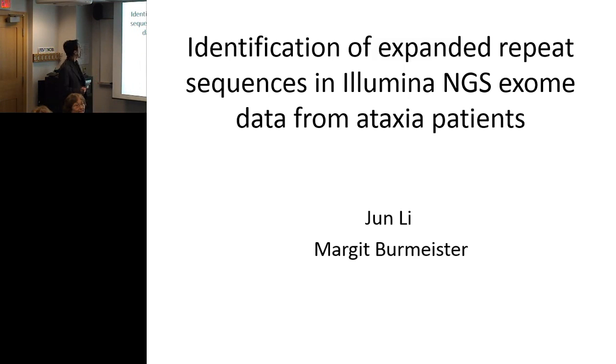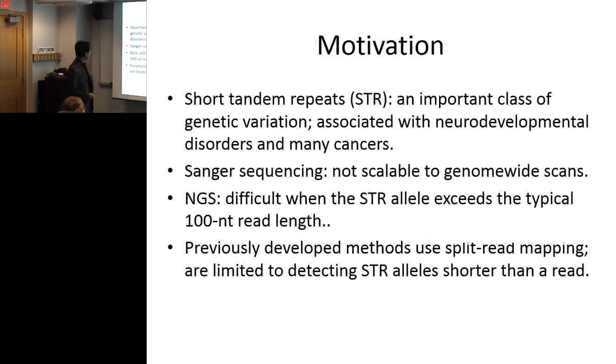So we'll talk about repeat sequences, how to call repeat expansion with short read next-gen sequence data. I thought about talking about the motivation.